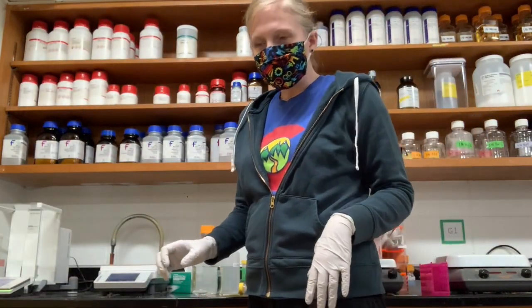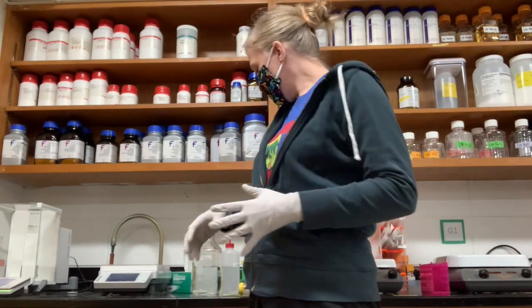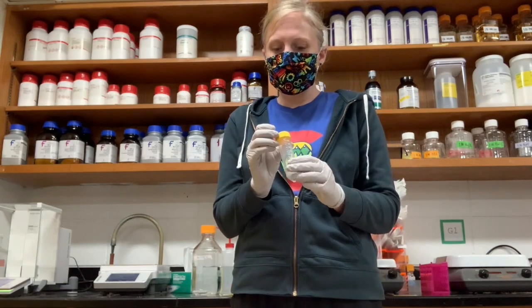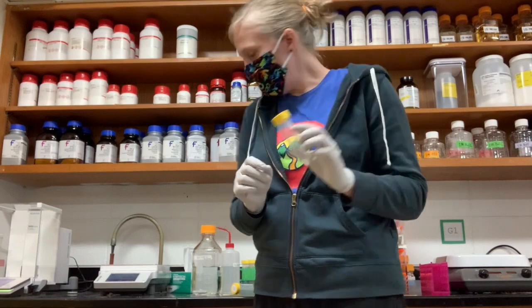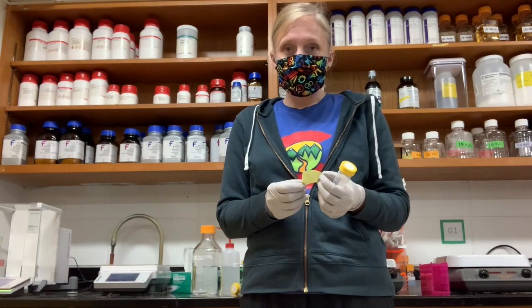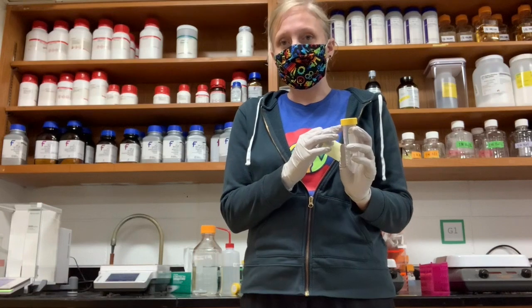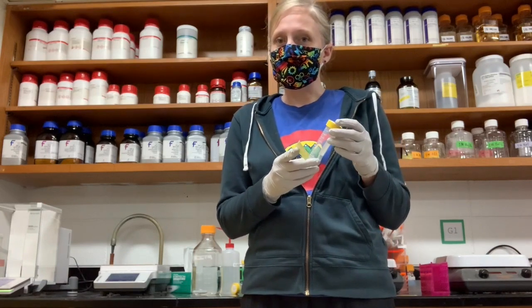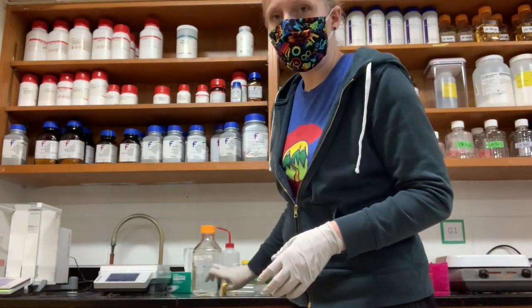So the first thing we're going to make here is 5 molar ammonium acetate. Anytime you need to make just a small amount of a material, you can use a conical tube. So I'm going to make this 5 molar ammonium acetate in 50 mils. I've already done my calculation, so I know that I need to add 19.27 grams and then fill it up to 50 milliliters with RNase-free water. And I'm using RNase-free water here because this is something we use during RNA precipitation, so it needs to be RNase-free.